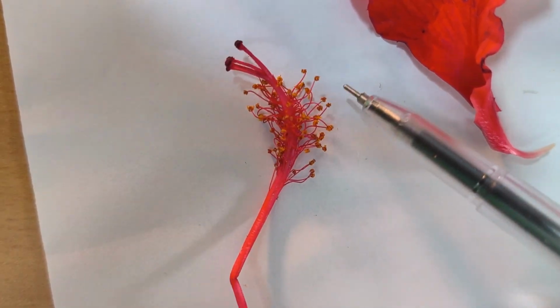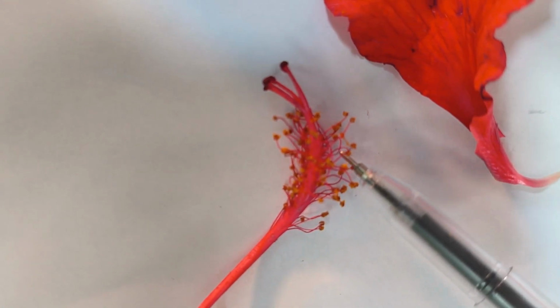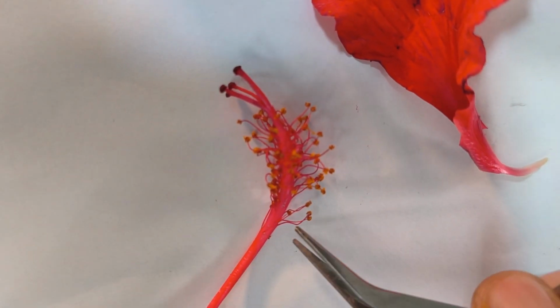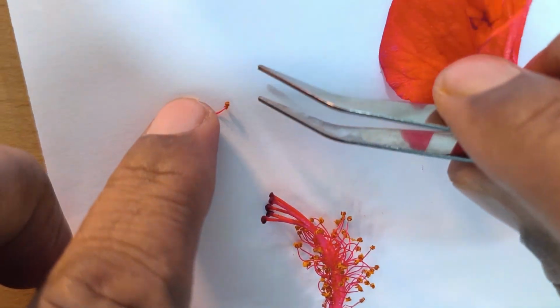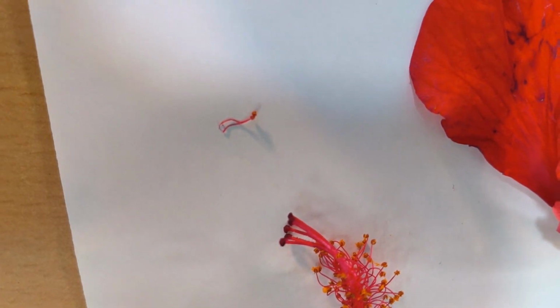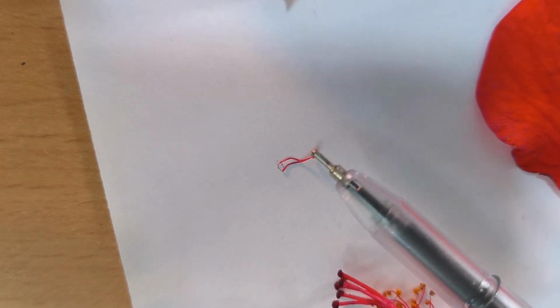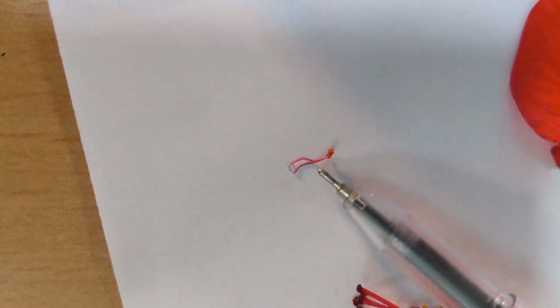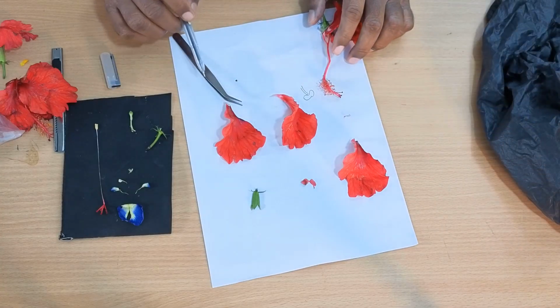So the stamens are very many, and individual stamens are like this. You can see the individual stamen. This is a filament and this is the anther lobe. This is a monothecous anther. The anther is like this. You can find a structure.